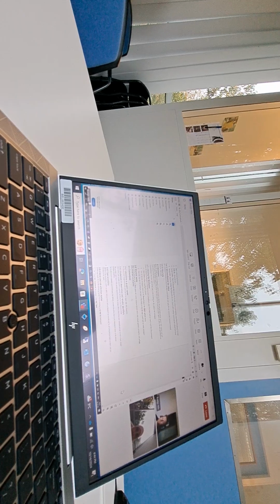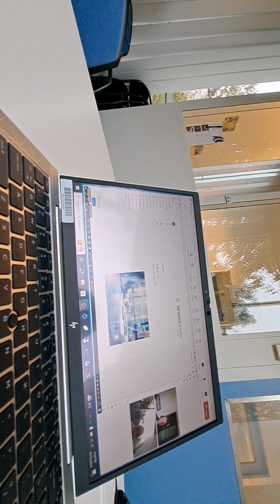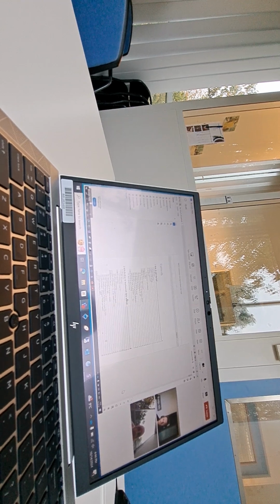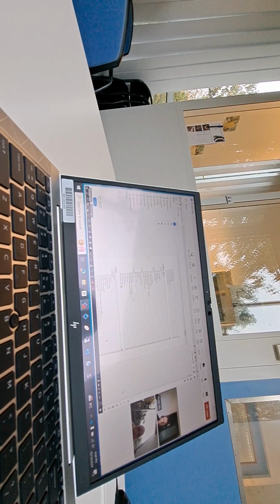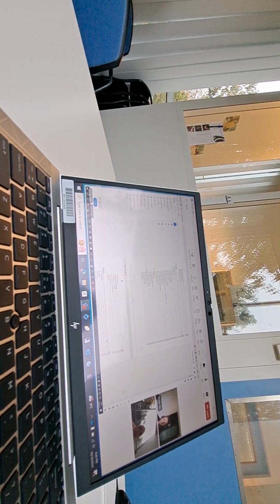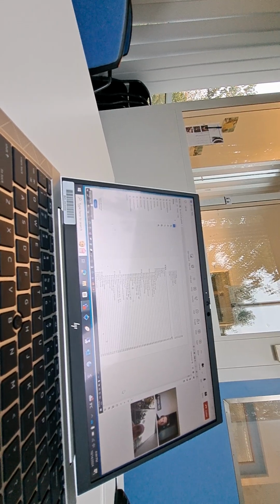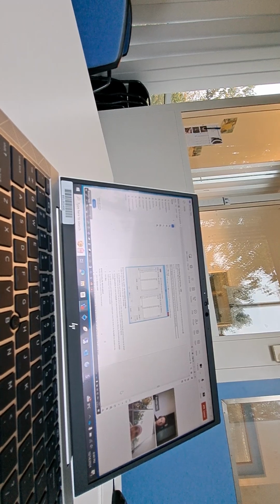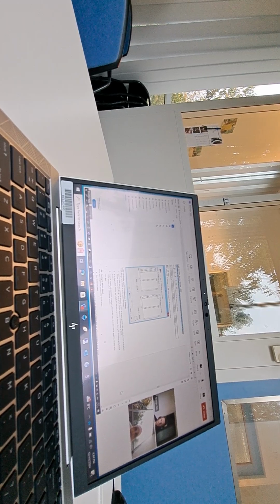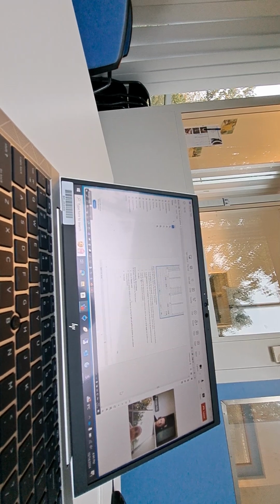Yeah, I'm just like, it's not... It's Simca 15, so it's a previous version of the one you have, but there are a lot of things which are similar. Like how to import data. Here about the pre-processing might also be useful, like SNV. So here how it is being calculated. So could be useful.